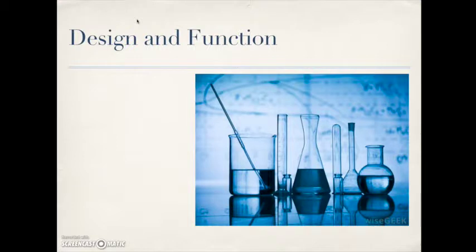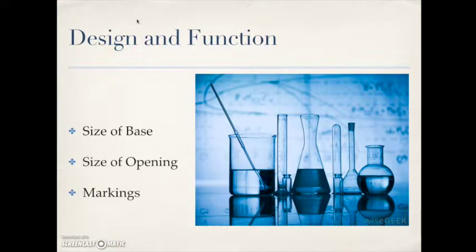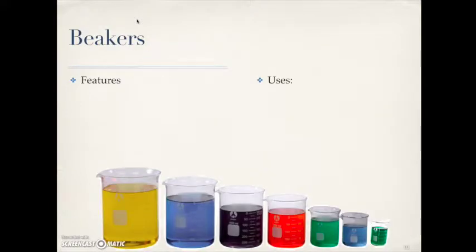First, we have to talk about the design and function of glassware. Glassware is designed specifically for a function, and so if we can take a closer look at that design, we can start to understand what various pieces of glassware are used for. Specifically, we should be looking at the size of the base where it sits onto the desktop. We also need to look at the opening from which liquid is dispensed and any markings that it may have to determine function. First, we'll start talking about beakers.